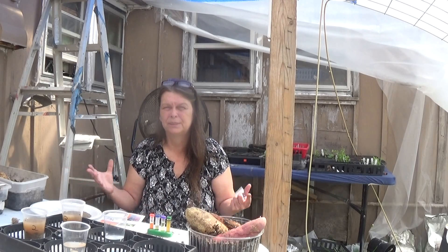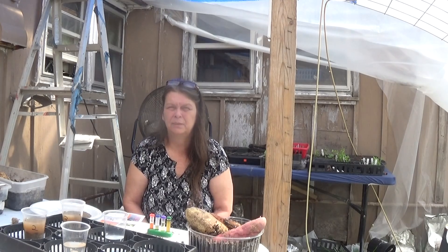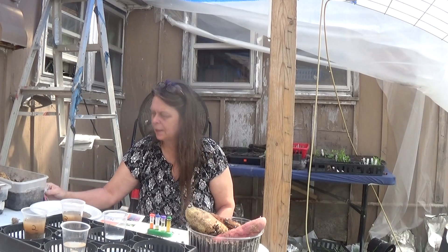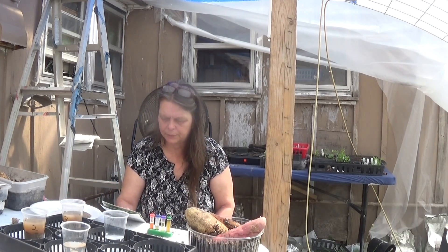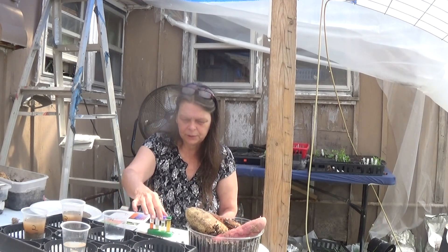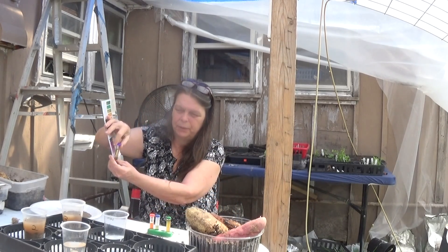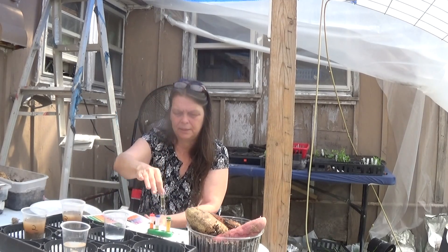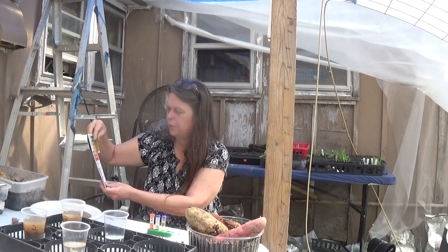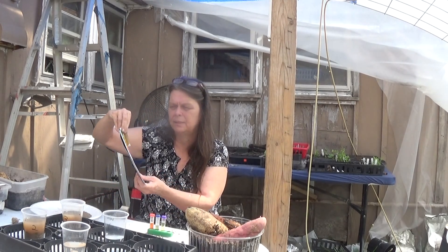I relied on mulches, like the Back to Eden garden method, to make sure everything lived properly and got enough water and moisture in the ground. But after doing these tests I found that my soil was high in potash and phosphorus, and nitrogen is really low on the scale — it's kind of yellow versus pink or green on the test. The pH is in line with 5.5 to 6.0, matching the ratings found on the internet.